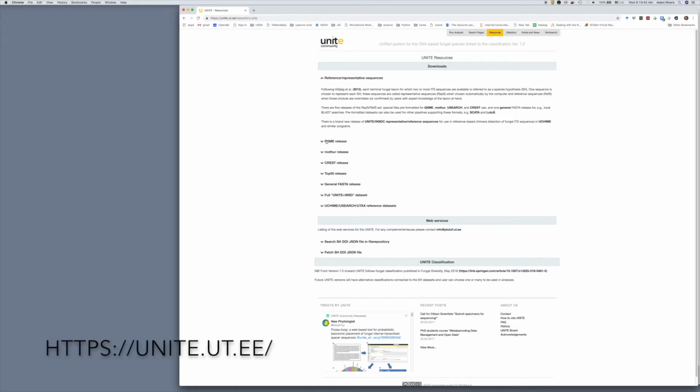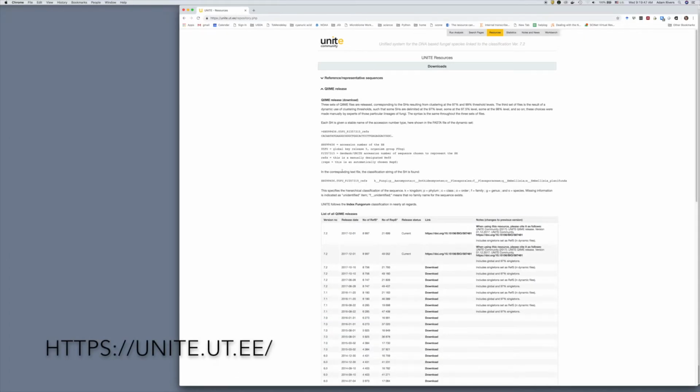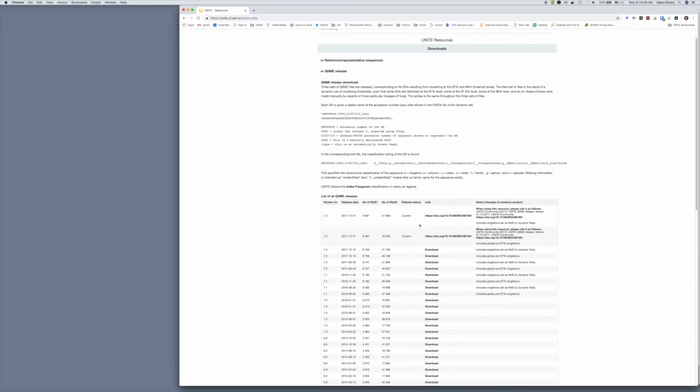And what you get back is a listing of the taxonomy broken down at different levels. And that's then put into the OTU table or the sequence variant table and can be used for downstream analysis. And I did want to show you the UNITE database website real quickly and just point out that it does have a download area for files that are formatted for QIIME 2.